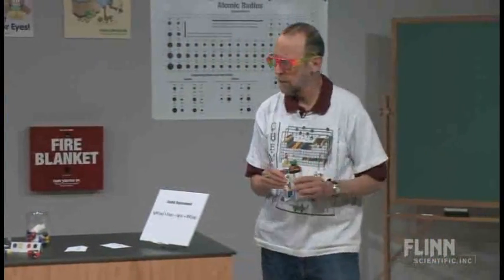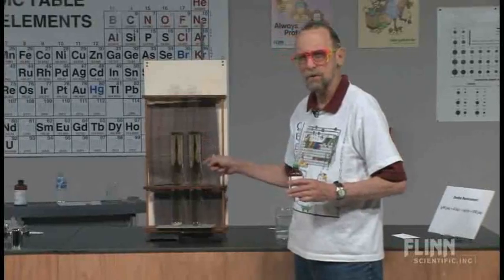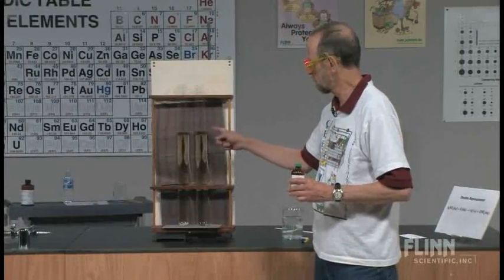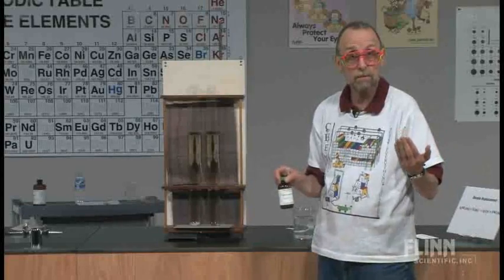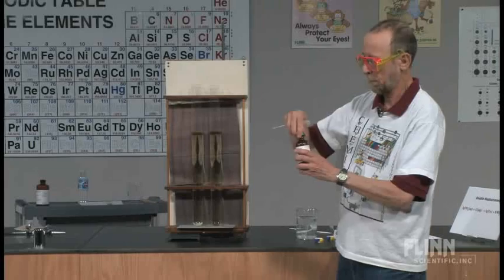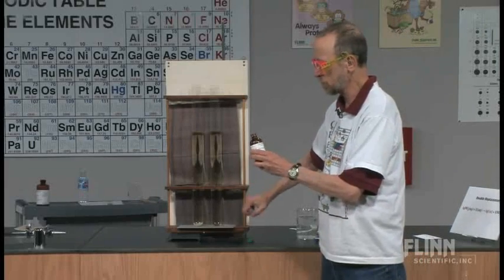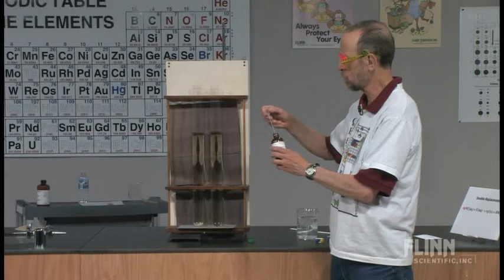I'm going to come around the other side. By the way, potassium iodide is used in some iodized salts. And silver nitrate may have been the first chemical you were ever exposed to. They used to put it in baby's eyes when they were born. Very dilute solution. So we've got some silver nitrate here, we're going to add it to this.